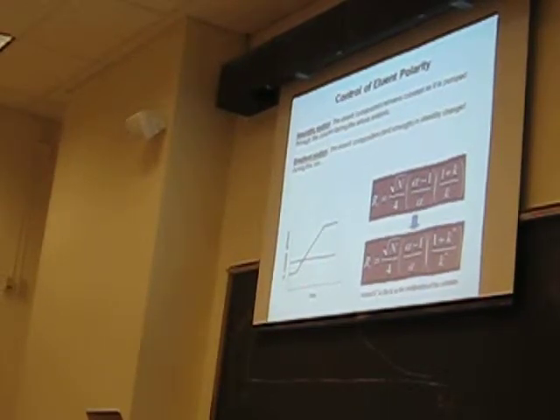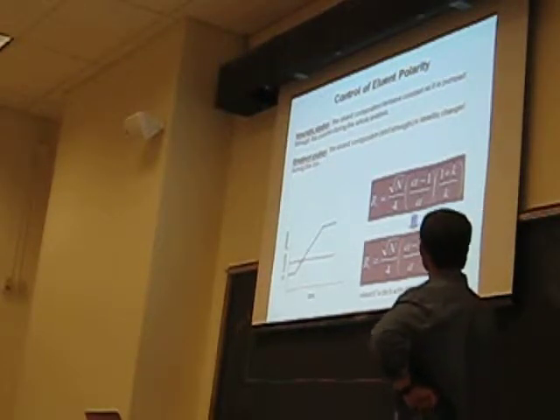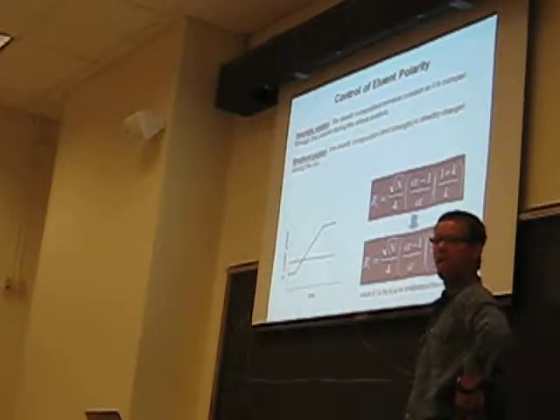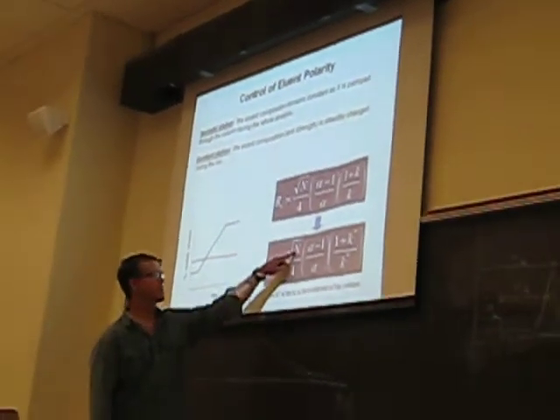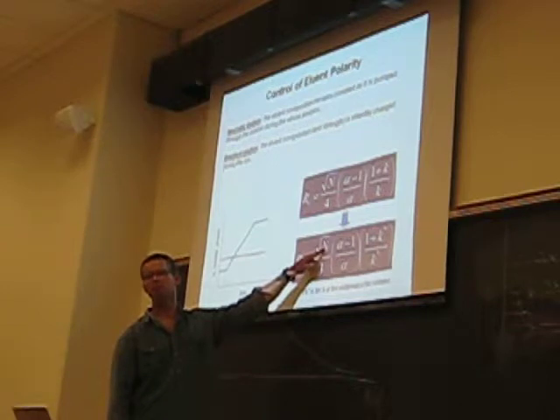Is resolution measured in any kind of units, or is it just the number? What are the units here? That's a good question. If we calculate that and put it in a report, are we going to have to include units? We know that this has a length dimension. This has a number dimension, but it's based off the length of the height of the plates, right?